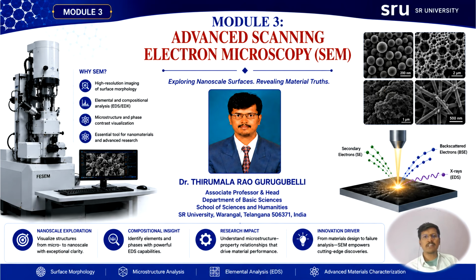You can also see examples of various nanostructures on the right side of this slide. These images demonstrate a variety of SEM-observed material architectures, ranging from spherical particles to porous networks and nanowires. These kinds of images we can obtain using the scanning electron microscope.